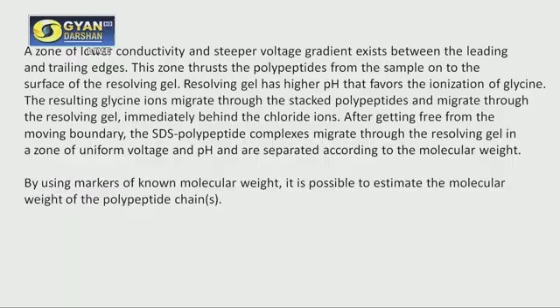So the basic principle is that here the proteins are resolved, or separated, on the basis of their molecular weight, just like DNA. So the proteins of small molecular weight will migrate faster and be present at the lower part, and the proteins of high molecular weight will be present towards the upper part. But mind that the total proteins should be resolved in the resolving gel part, they should not remain in the stacking gel part. They should all be visible in the resolving gel.